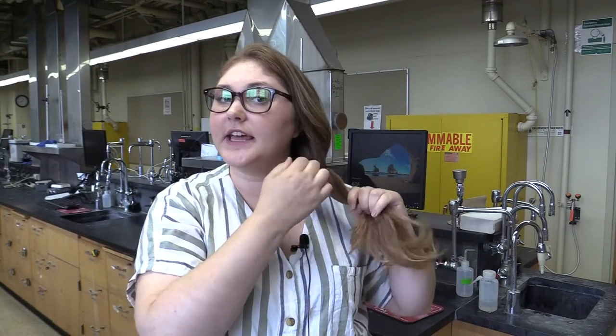One more thing. Long hair in a lab can be a serious hazard, so make sure you tie it up with a hair tie, so that it doesn't get in a beaker with solution in it, or maybe even a burner with a flame.